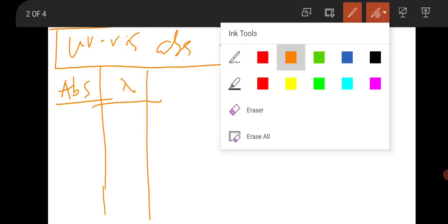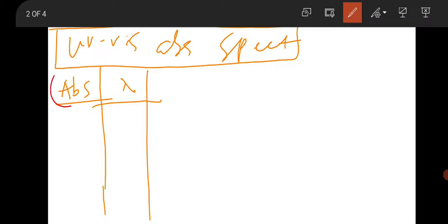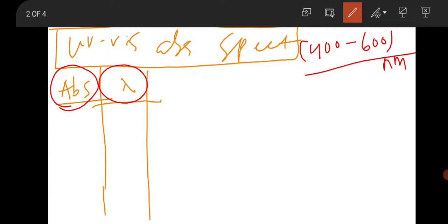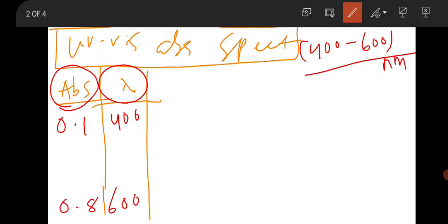After the measurement, you will have two data: absorbance and lambda. Suppose you are scanning your sample from 400 nanometers to 600 nanometers. So your wavelength will be from 400 to 600 nanometers, and the corresponding absorbance will be 0.1 to 0.8 atomic units. Now, with this data, how can you find the bandgap? That is the question.